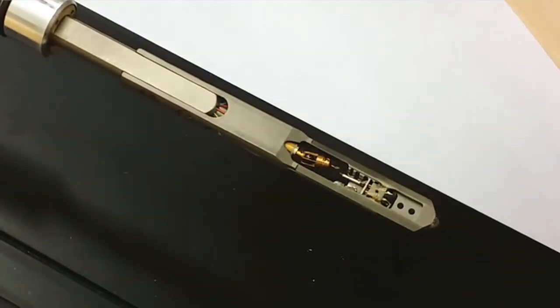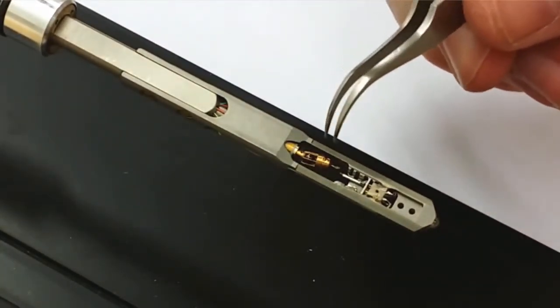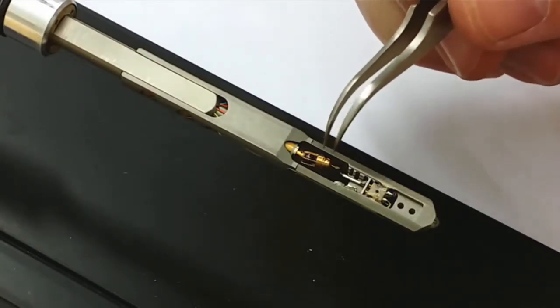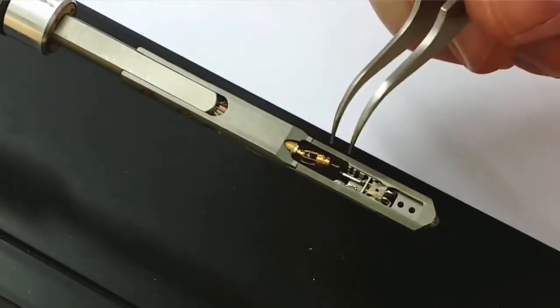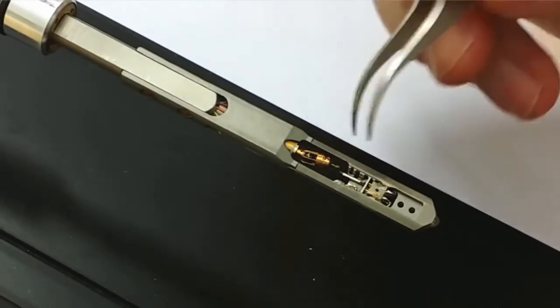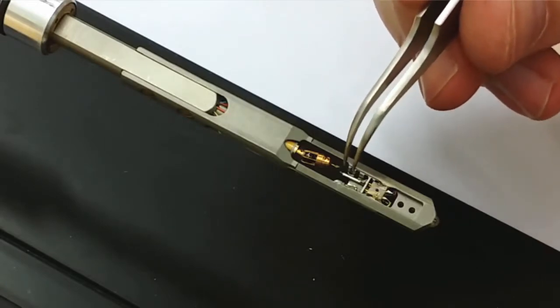This is the final sample holder that I'm going to show you. This is a much more advanced one. Here you actually have a moving probe on top of here. This probe you can use to in situ probe and contact the materials. Here you don't use these grids, but the sample is instead glued to a small metallic wire that you see here in front of the holder.